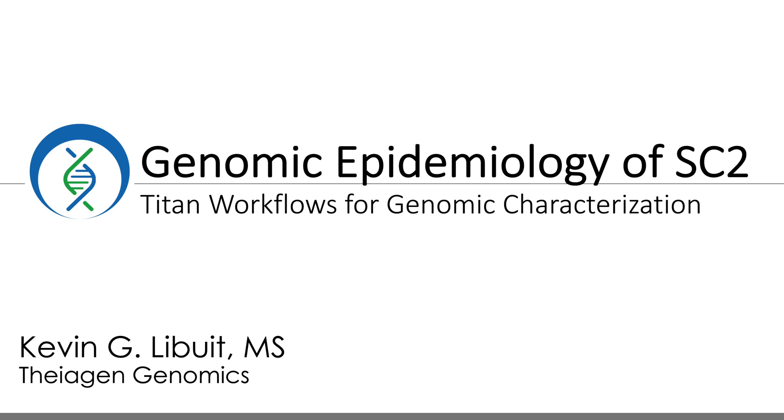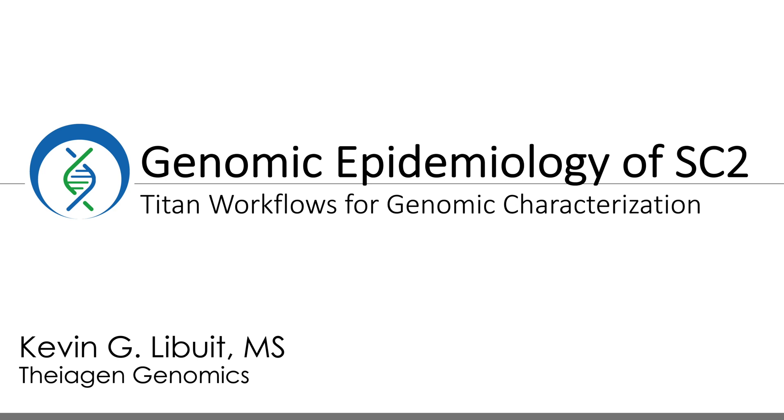In today's video, I'm going to be diving into our Titan workflows for SARS-CoV-2 genomic characterization. I'll start off by presenting some background information on the intended purpose of these workflows and how they work, and then we'll jump into a Terra workspace to see how to use these workflows. This video will cover a lot of similar content to the Titan Illumina Paraden v1.2.0 release video, but with a broader focus on all of the Titan genomic characterization workflows, not just for the Illumina data.